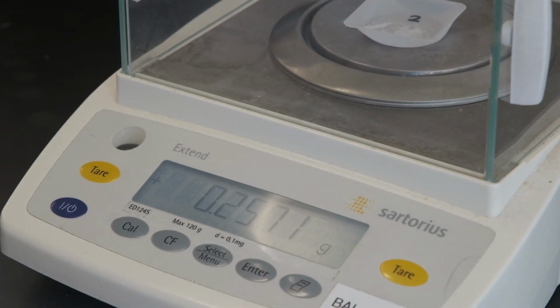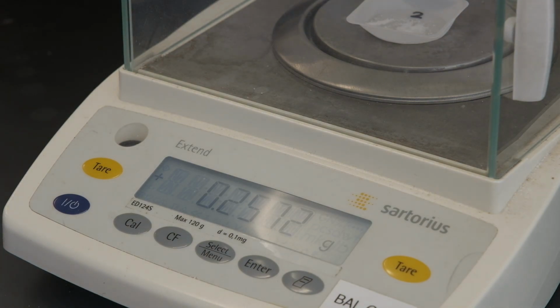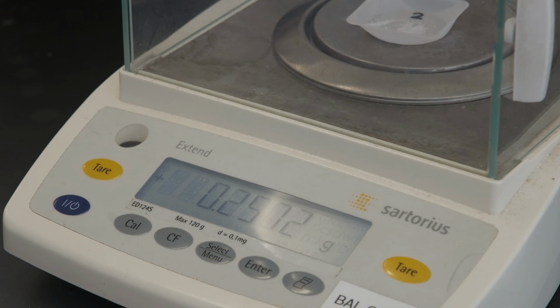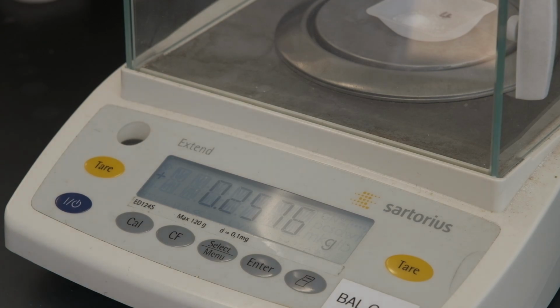This is for our sample one. This is the mass for sample two. So record to the appropriate amount of significant figures. This is the mass of the unknown solid acid for sample number three. So record to the correct number of significant figures. This is the weight of the unknown solid acid for sample number four. So record to the appropriate number of significant figures.